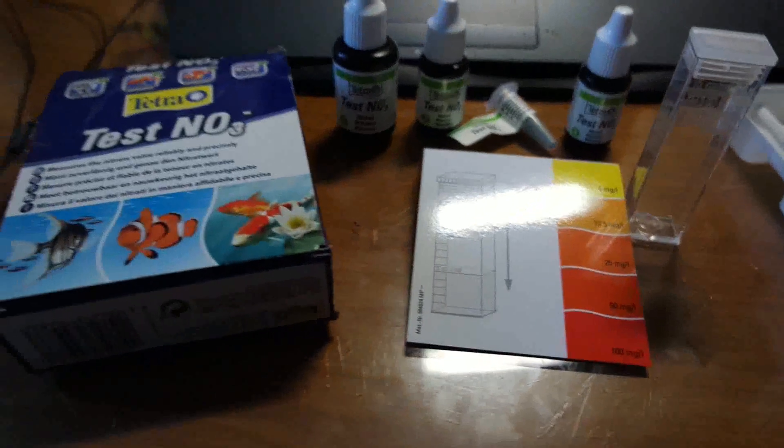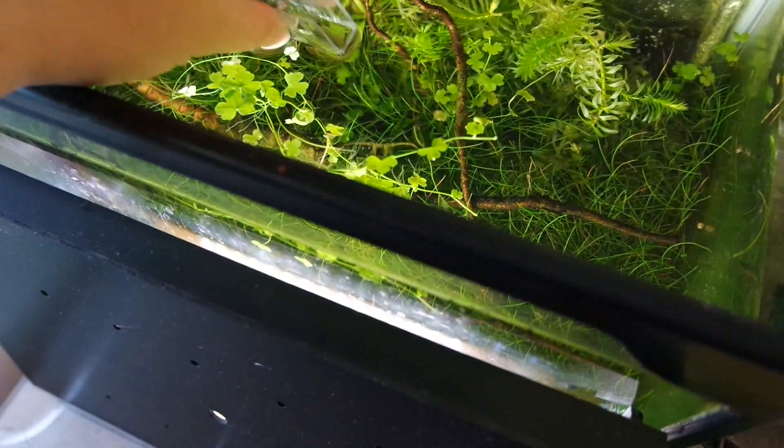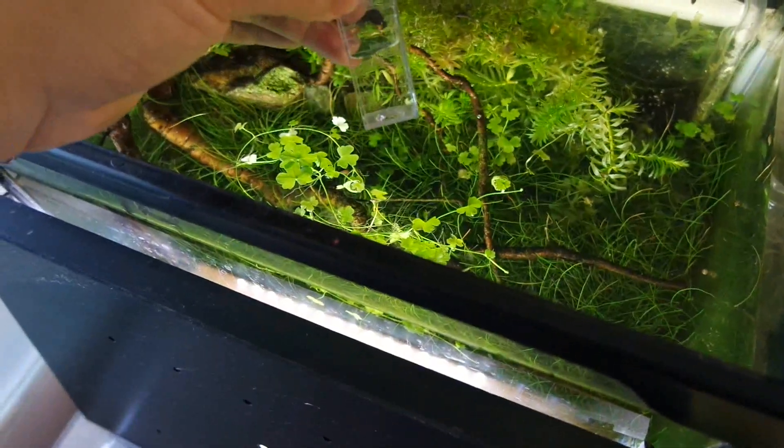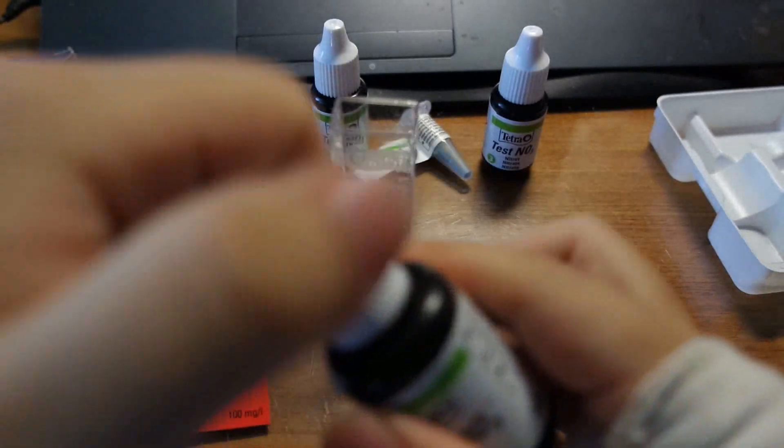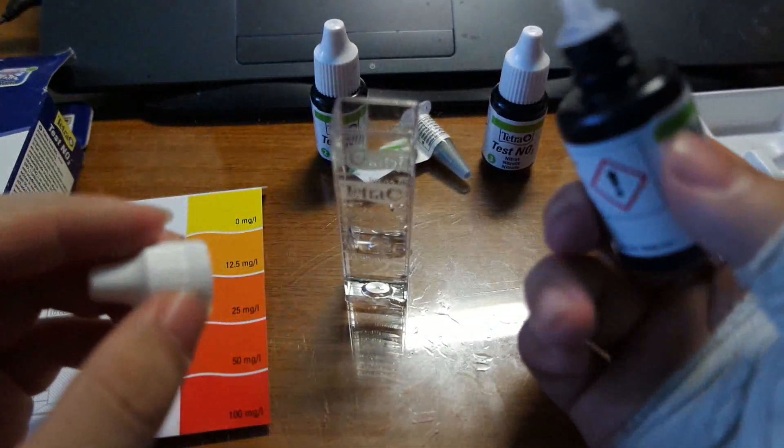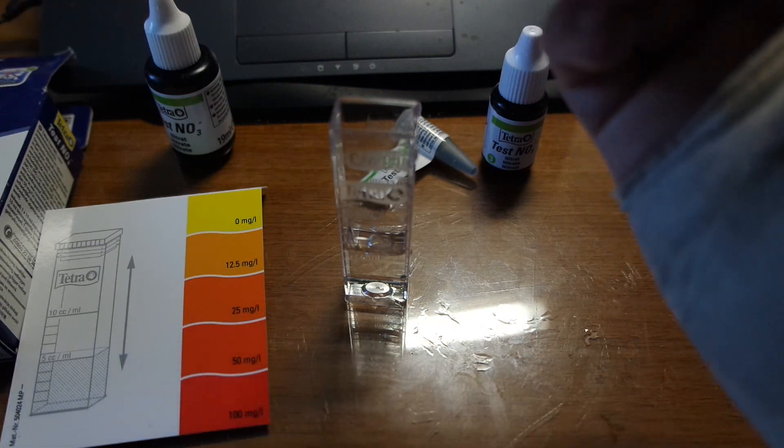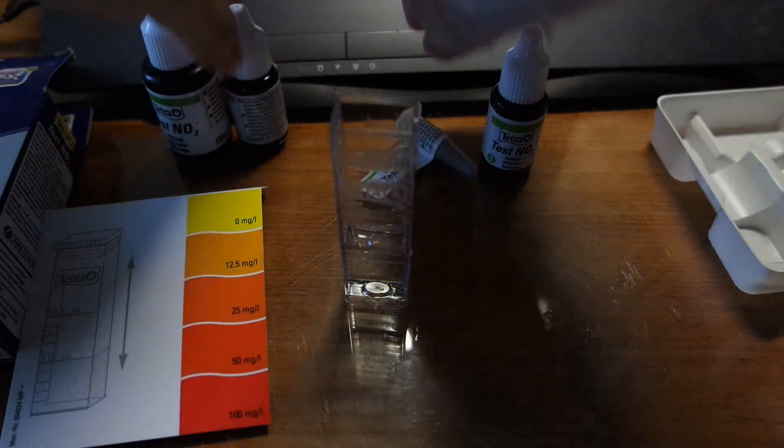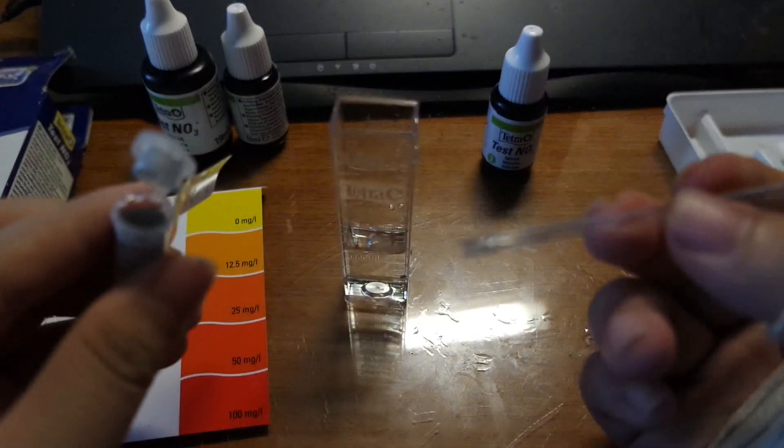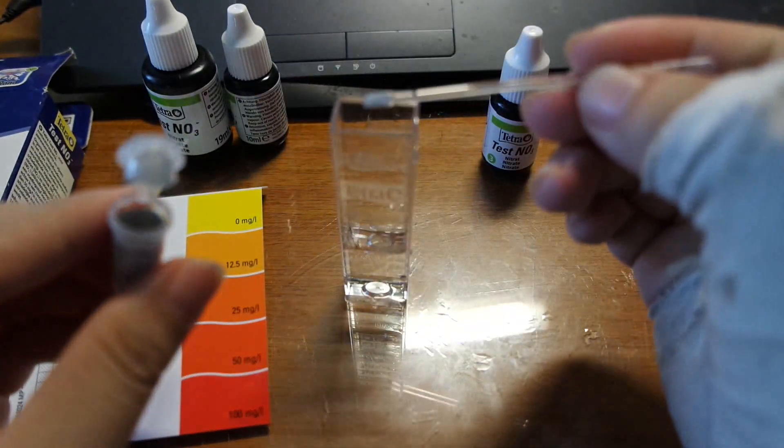I will be testing all of my tanks. First up is my No Water Change Nano Planted Tank. I'll be getting a little bit of water there. Okay so here is the tank water. First thing I got to do is add 14 drops of solution number 1, and then we add 7 drops of solution number 2, and then we add a small amount of this powder here. The kit comes with a tiny little spoon for that. So I am just going to scoop some up and add it in.